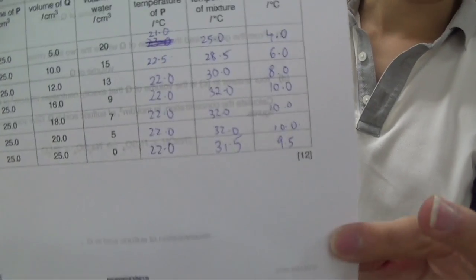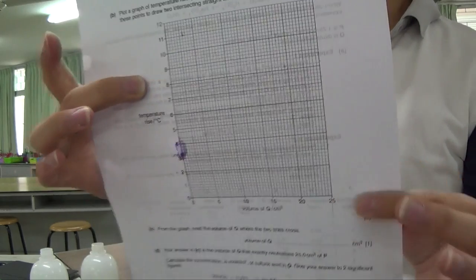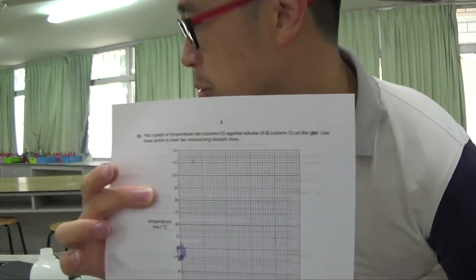So I have the rest of my table values, and I think I'll continue this on my iPad screen in another tutorial video where I will talk about data processing. A lot of these experimental videos are more about data collection, which I just did. It's 12 marks. You will be judged based on how accurate your data is compared with your supervisor, which is most likely your teacher or another teacher from your center who will have to do the practical and submit the result to Cambridge, unless you're doing the alternative to practical paper, which of course they can give you the result, then the data processing will matter more to you, so you can catch my alternative to practical tutorial playlist.